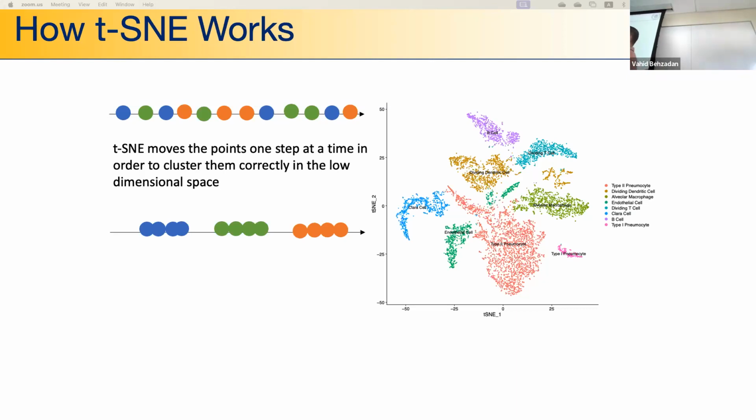So they are basically pneumocytes, but they found that they perform different functionality, and that's why they separated. But is there an additional validation, after clustering, to make sure that the cluster is actually matching the functionality of it?